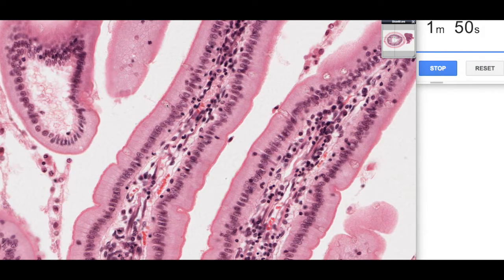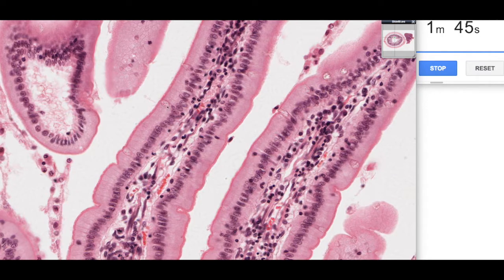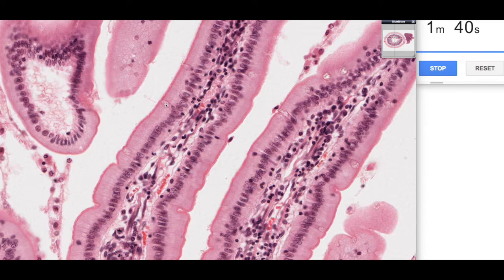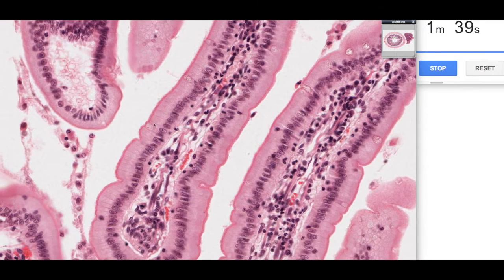Another common cell type found within this epithelium are the goblet cells, characterized by having these round unstained regions. That's because mucus is a highly glycosylated glycoprotein which doesn't interact with the stain, so it actually looks unstained. Here's another nice example.